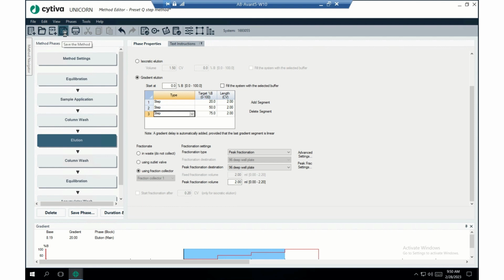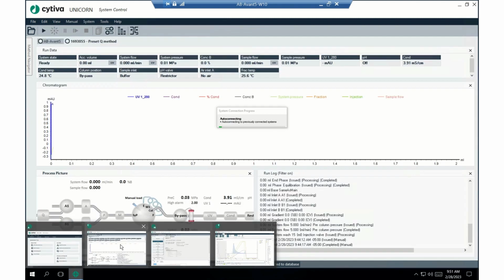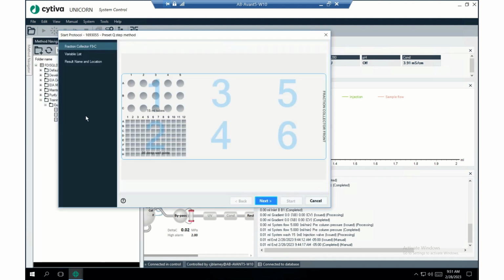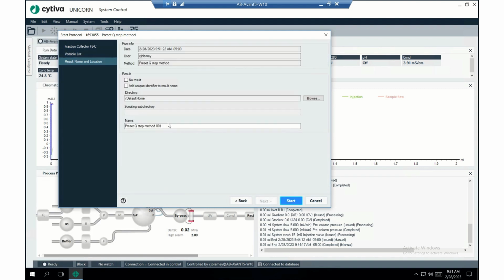All right. So you know what I'm going to try to do is make the equilibration much shorter so we can record the whole thing, because I've already re-equilibrated a column. Okay. So we'll save. Then we'll just start the new method really quick. Earlier in this video, I just went over it, so we'll just start it real fast. Preset step method. Okay, next. Next. Yeah, we'll just do that. Capto Q. We'll do it for Capto in here.